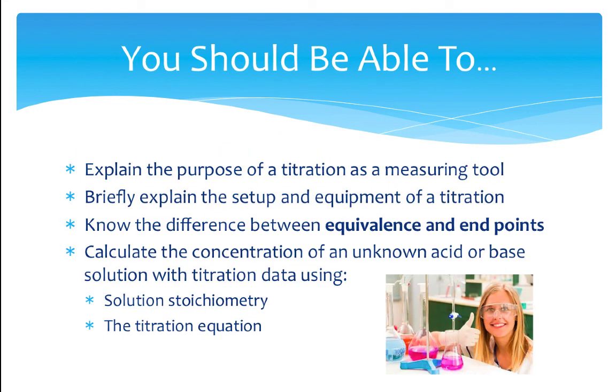At this point in the game, you should be able to do a couple different things. First of all, you should be able to tell me what the purpose of a titration is as a measuring tool. What is its job? You should be able to briefly explain the setup and the equipment of a titration. I think that's something a lot of us will be a lot better with during this week as we work on titrations in class. You should definitely know the difference between an equivalence point and an end point. There's a subtle difference there, but you should be able to talk about it.